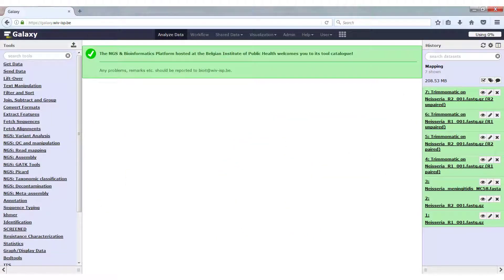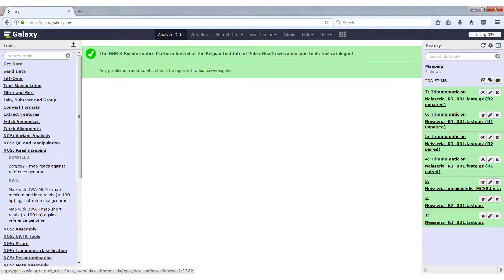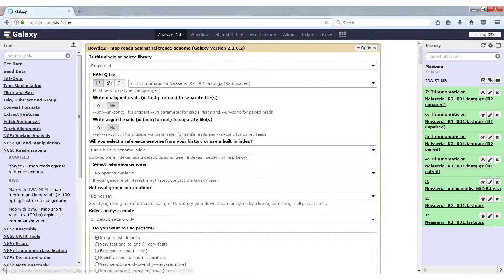There are two tools available in Galaxy that can do read mapping, namely Bowtie2 and BWA-MEM. We will start with the demonstration of Bowtie2, and we can find this in the section NGS read mapping under Bowtie2. For the files, I just used the same files as in the previous tutorials. I created a new history, loaded the files again, and ran Trimmomatic on them.